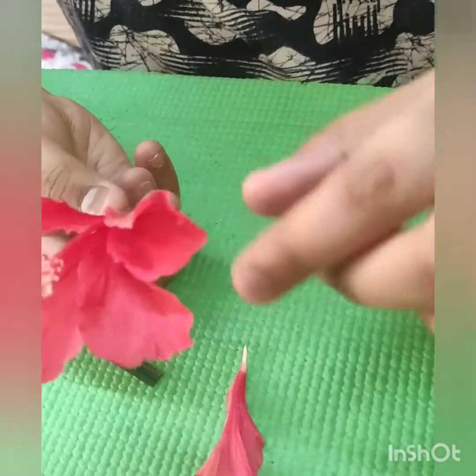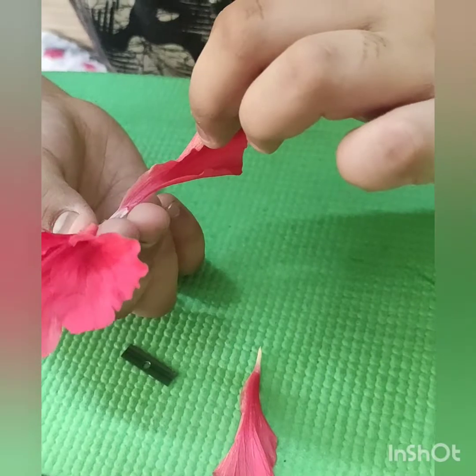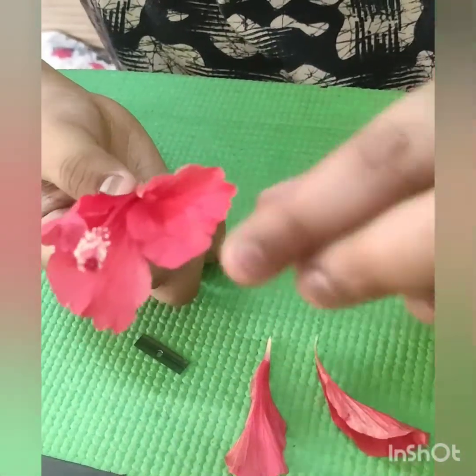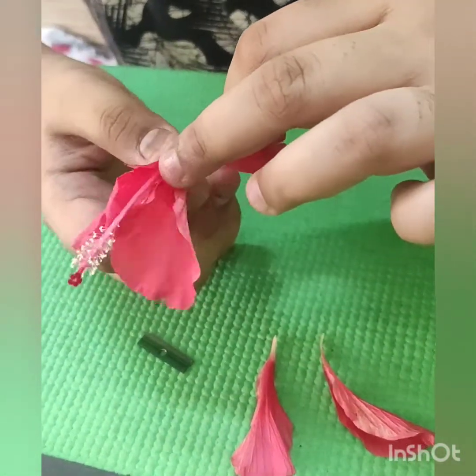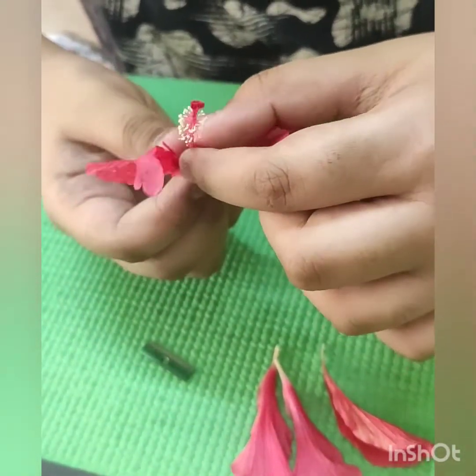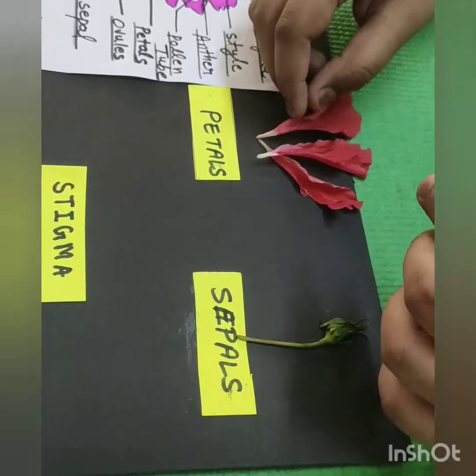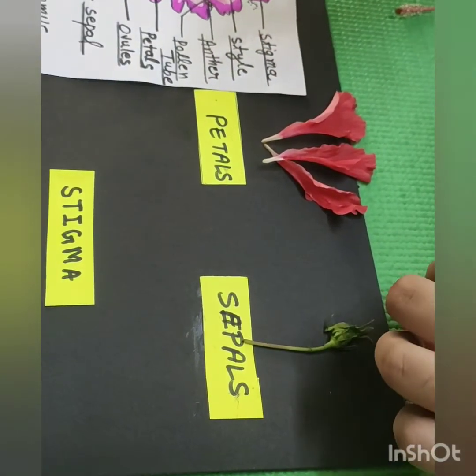The next part is the petal. After removing the sepal, we have to remove the petals. I am going to remove the two beautiful colored petals. These are the red parts. I have removed the petals.